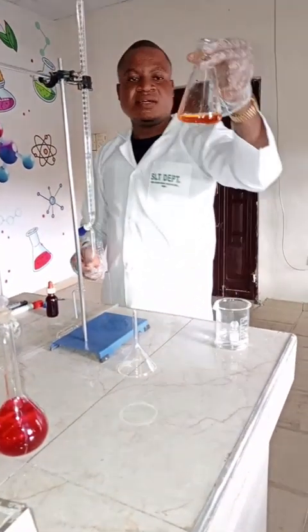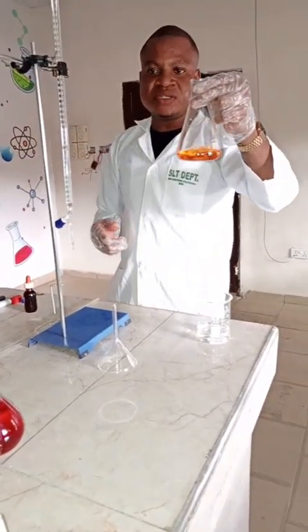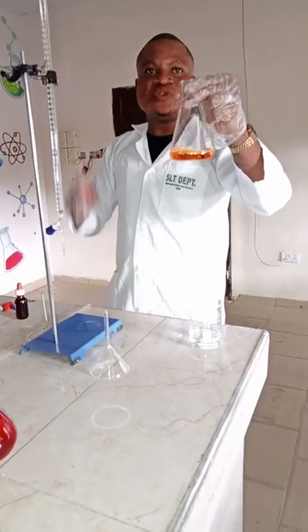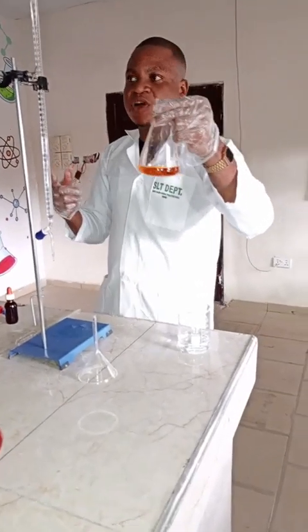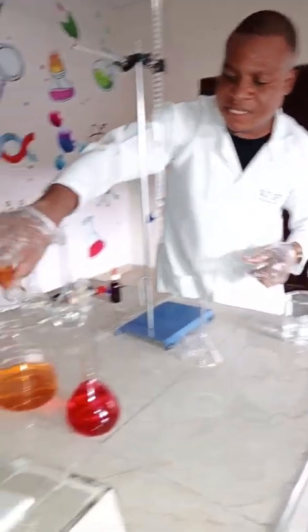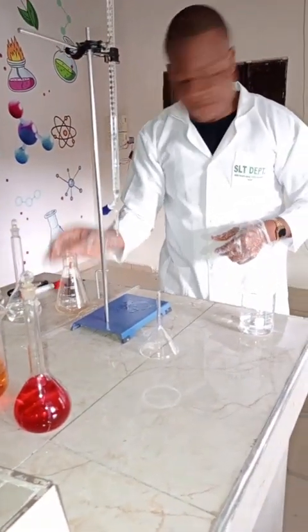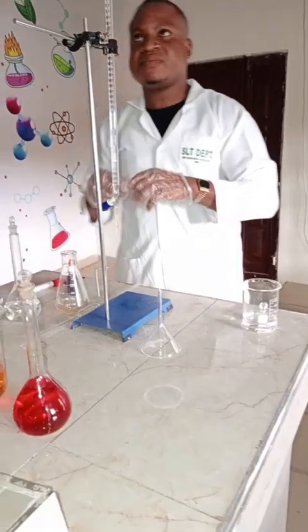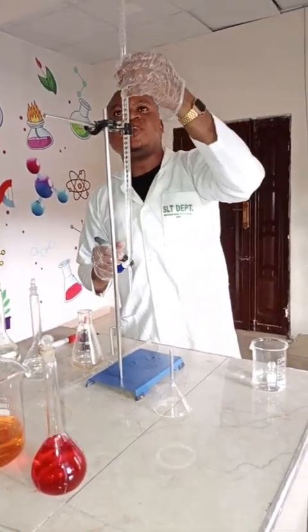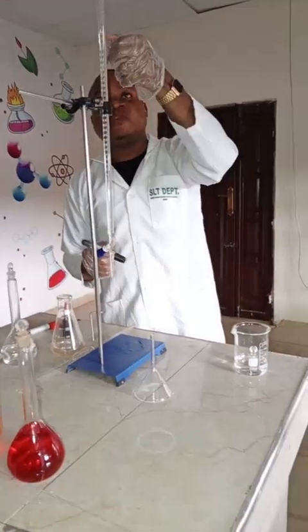Now, if you look here, there is a color change, and this is the endpoint. At every endpoint, you notice a color change. Are you following? Now I'm going to discard this. I'm going to take my burette reading, reading the lower meniscus. It is still 10.00 from here.